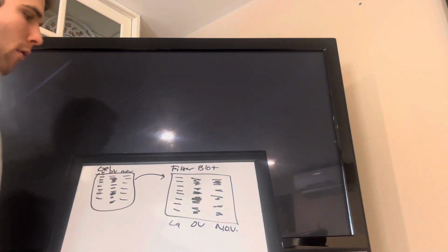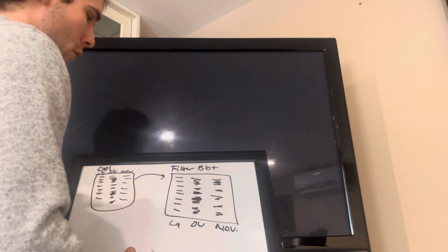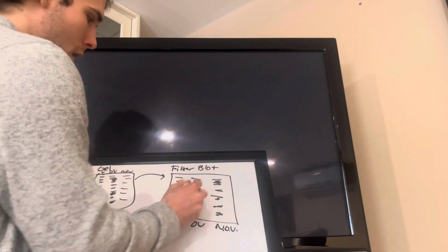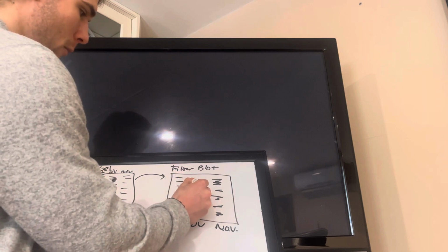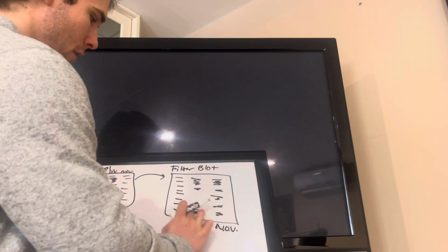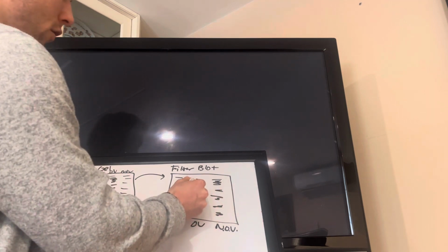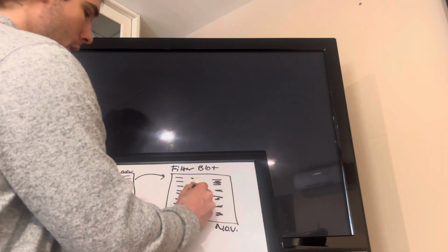And now if we wanted to draw what it would look like if the primary antibodies were to bind to P53 in this filter paper, let's just take this little band and say this was P53's molecular weight and we had a band here. Ideally what would happen, I'll just erase some of these so we can actually see the drawing, we'd have the primary antibody, which binds to the P53 protein, so it would bind right there in the blot, and then we'd have the secondary antibody.